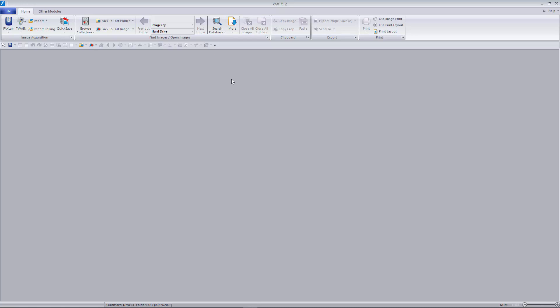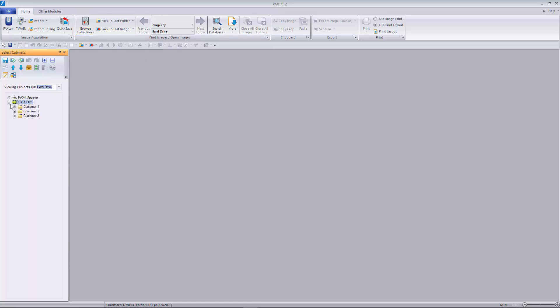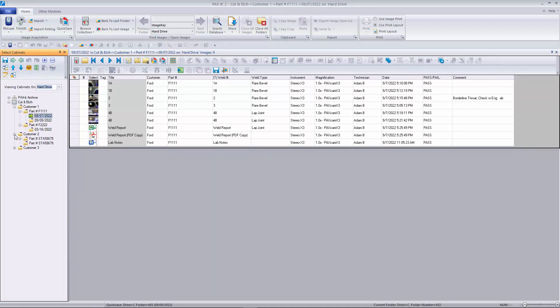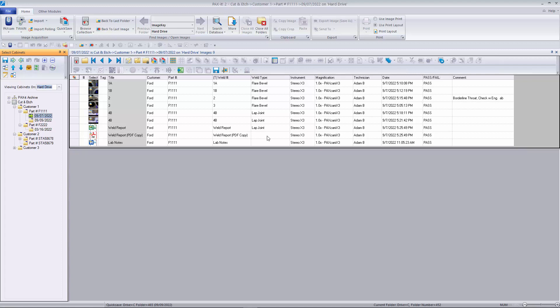Images are stored in Paxit's electronic filing system, which marries a familiar explorer-style folder tree with a powerful relational database. Users can easily navigate to specific project folders to find images, or they may search the entire collection by their custom-made database fields.